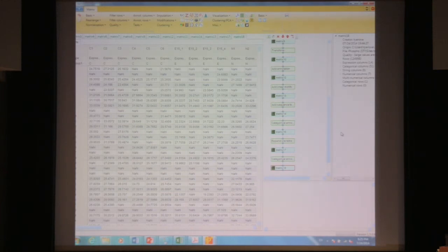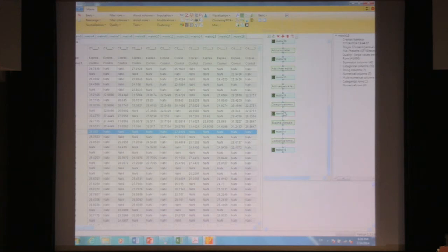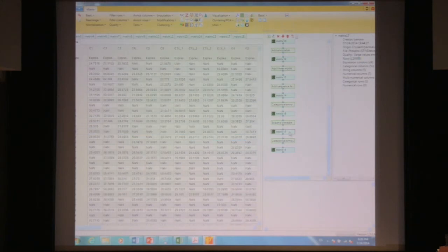Okay, so hopefully now you have experimental groups again for your expanded site table. Something I should point out is the effect of that site table expansion. If I go to matrix 15 on my screen, which is the one before I expanded the site table, we can see the number of rows was 41,000. But immediately after expanding the site table, it's 120,000. So basically we tripled the size of our data, because now we're working with single, double, and potentially even triple phosphopeptides.